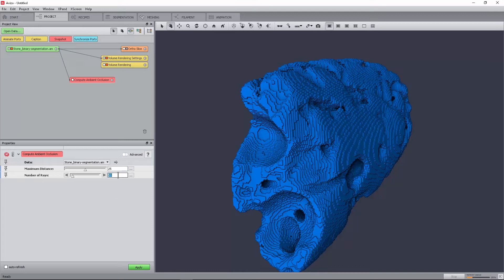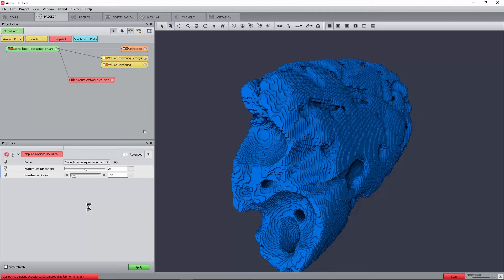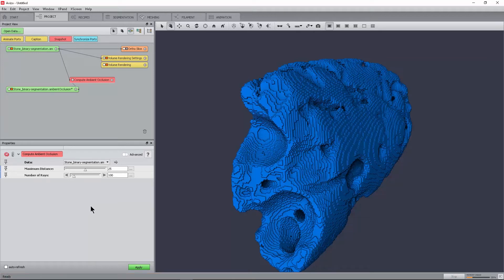Set the number of rays port to 100 to increase the sampling, though 50 usually suffices. In order to compute the ambient occlusion field for the background of the binary image, press Apply. Depending on your graphics card, it may take a few seconds, up to a minute, to compute. The compute ambient occlusion module requires an NVIDIA graphics card supporting CUDA compute capability 2.0 or higher. To prevent CUDA errors and timeouts, it is highly recommended to use a high-end graphics card.